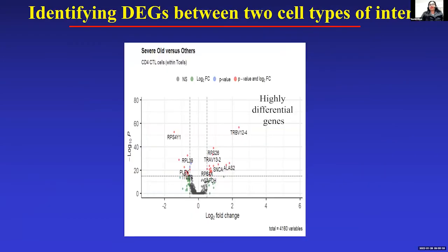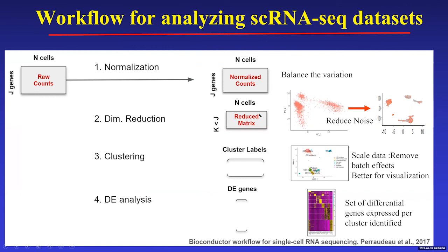As I mentioned, in the protocol itself, you are reducing the noise before, and making it more informative for the clustering, because you are telling it that although each cell has, let's say, 2000 genes, only 30 or 40 genes are highly variable, and make the difference between one cell being different from the other, even biologically and functionally. That inference will help us in doing a clustering. That's the reason we do first PCA and then go about clustering.